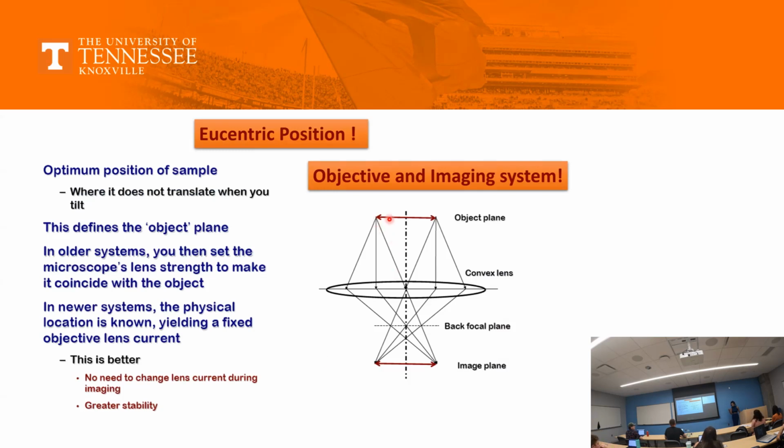This is your object plane, or your object, and you made sure that your light from the condenser is in good alignment and falling on the object. And then this is a ray diagram, and you see that there are lines falling on the convex lens. And you see that they are meeting at a focal plane, and then there is an image plane here.